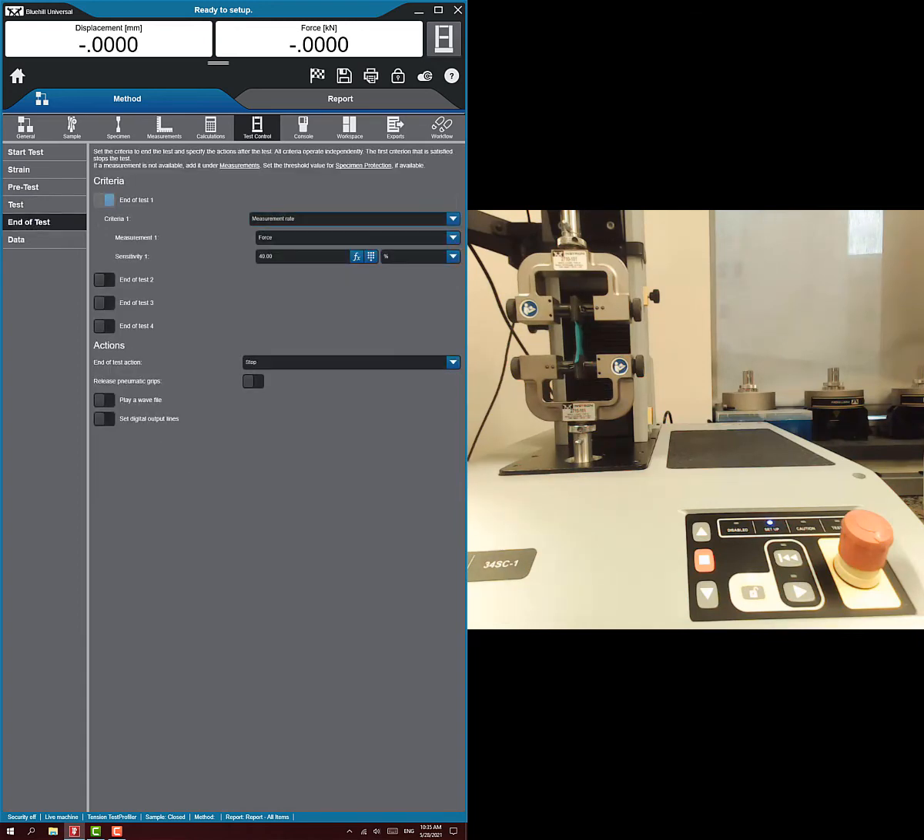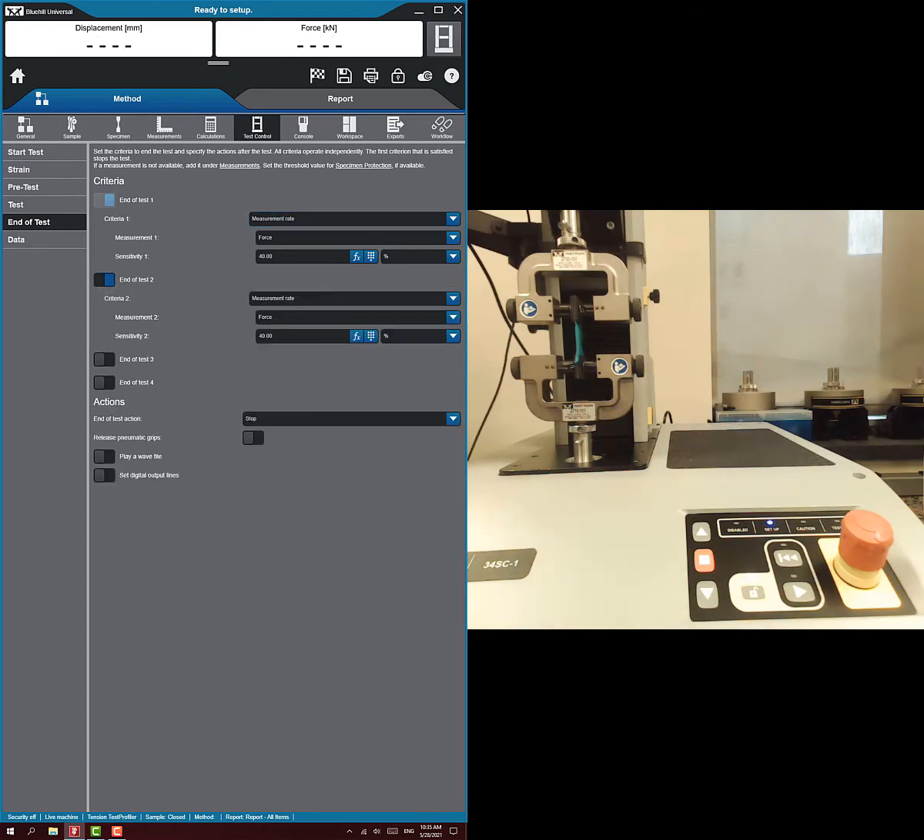Then we go to end of test. One end of test condition is if it breaks. Another end of test I always want you to include is that the force is less than 0.8 Newtons, just in case, to protect the load cell.